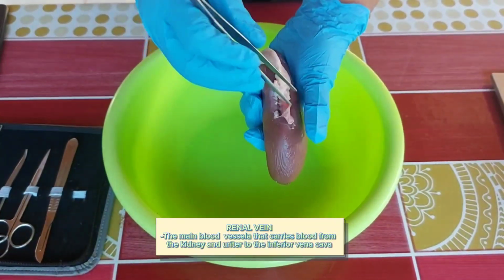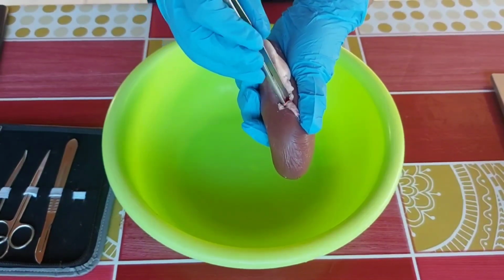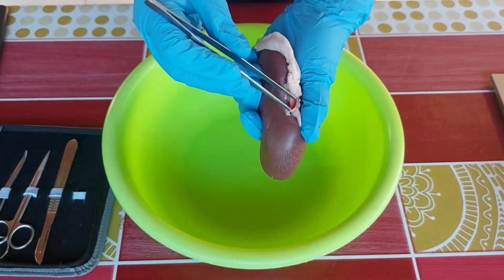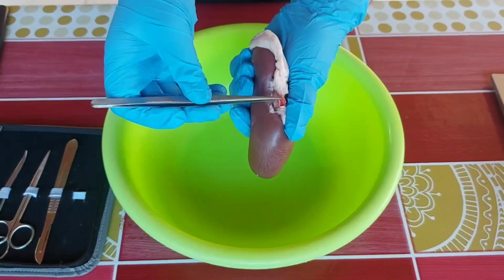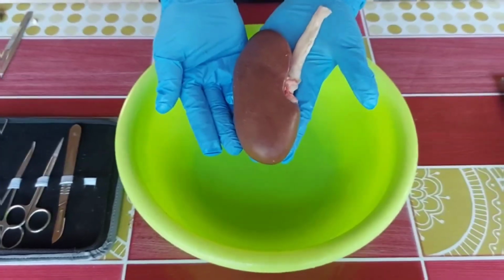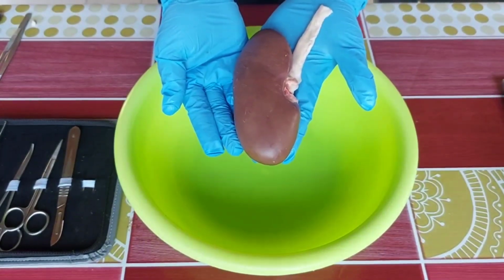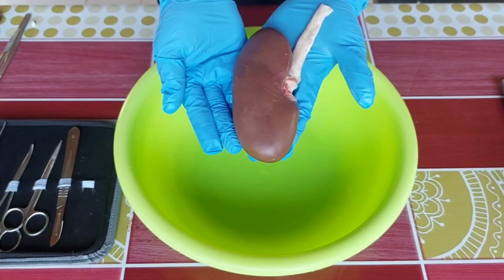This is the renal vein. The renal vein is the main blood vessel that carries blood from the kidney and ureter to the inferior vena cava, a large vein that carries blood to the heart from the lower part of the body. Now we're done examining the outside of the kidney. Let's now cut the kidney in half lengthwise from the side.